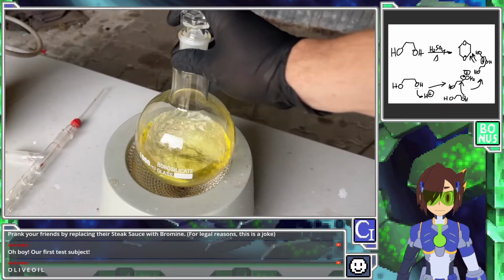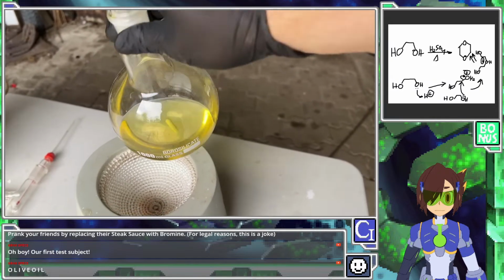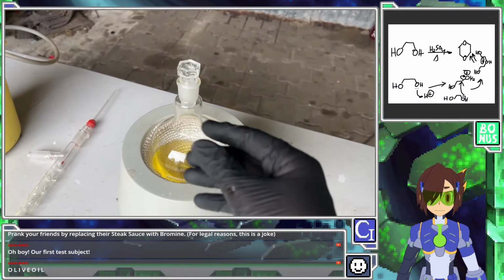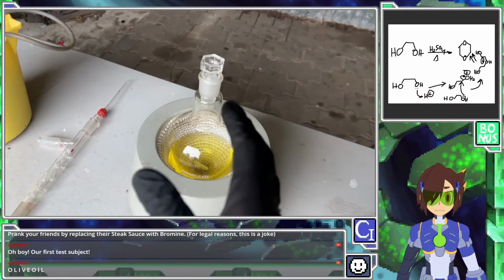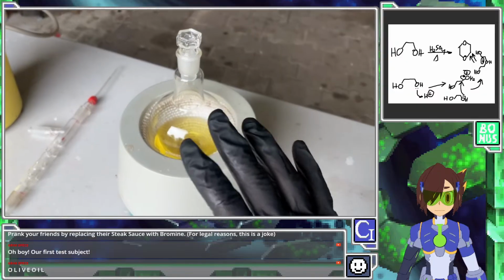Here, our dioxane, it is reasonably dry. All the water has been removed. There is probably still some dissolved. Water and dioxane have a lower boiling azeotrope, so as long as we throw away the first stuff we collect, that should have all the water in it. From then on, we'll get dry dioxane.